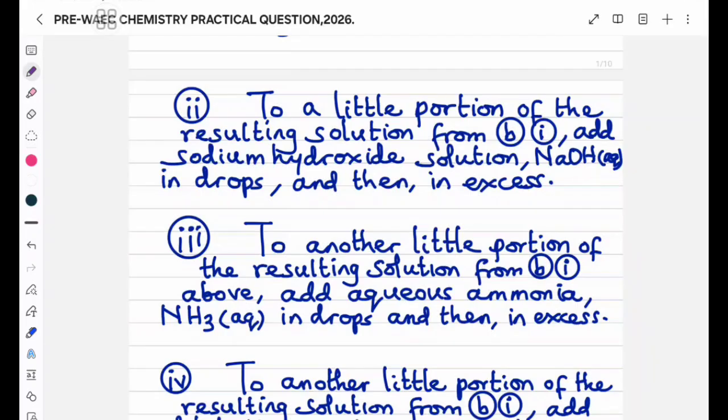So there will be a mixture of undissolved particles of the residue and a solution at the upper layer. On allowing the mixture to stand for a while, the particles will settle at the bottom of the tube, while the clear solution at the top, the supernatant, will be observed.